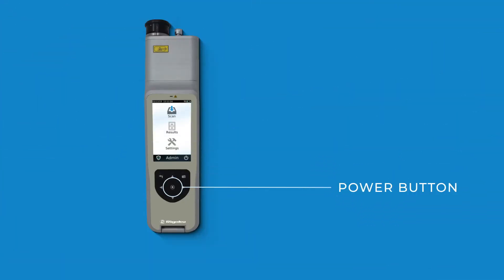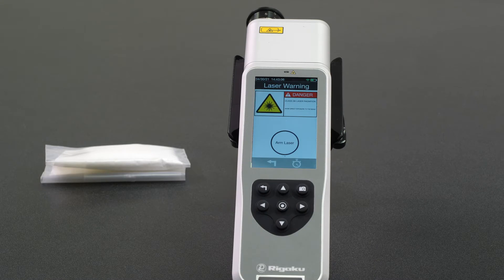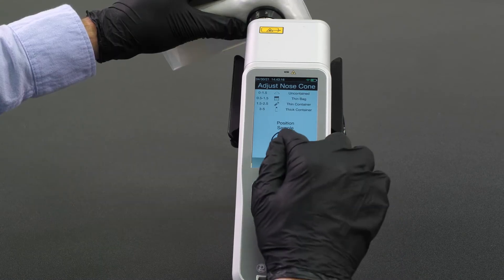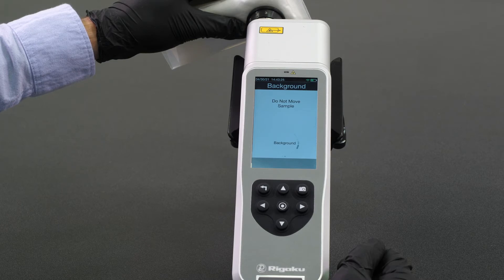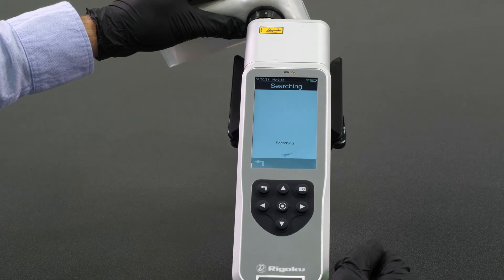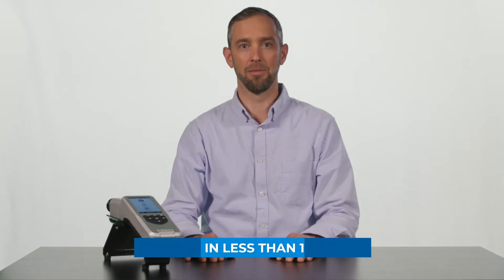The power button is located here. With the nose cone setting set to three and the sample flush against the nose cone covering the aperture, let's start the scan sequence. Select scan, select arm laser, and select scan. The instrument will begin scanning the sample. Observe the red laser warning light that will turn on when the laser is energized. Once the spectral data on the sample has been collected, the instrument will search its library for a match, and when a match is found, an identification is made. The typical analysis time is less than one minute.